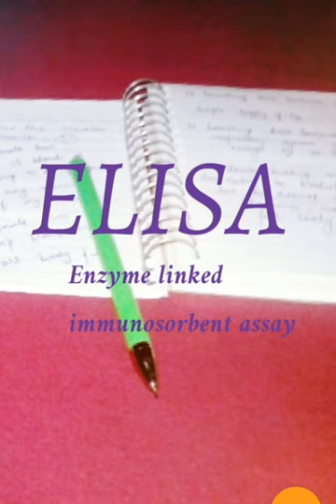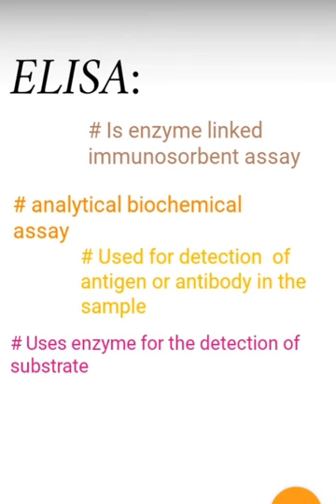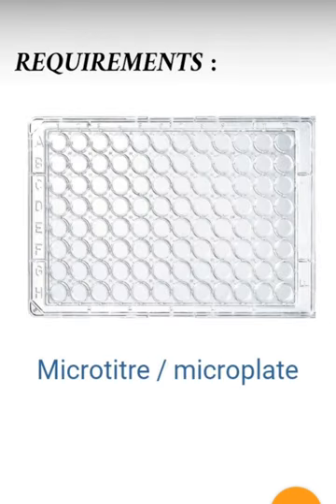So let's start with ELISA. ELISA is an analytical biochemical assay, and it uses an enzyme for the detection of the substrate, for the detection of the results. So what are the requirements to perform ELISA?